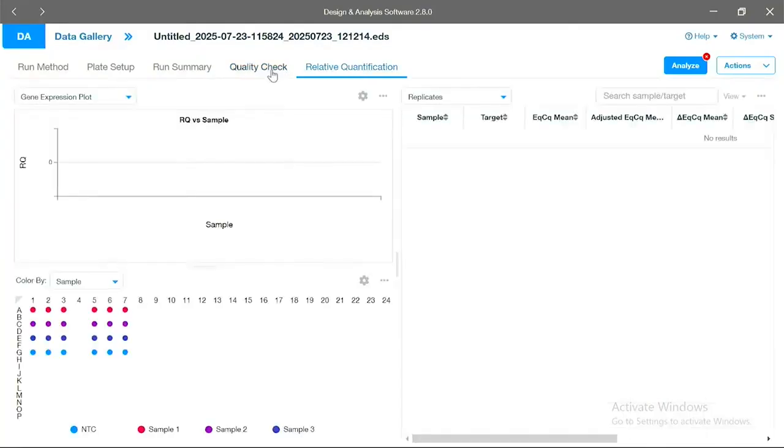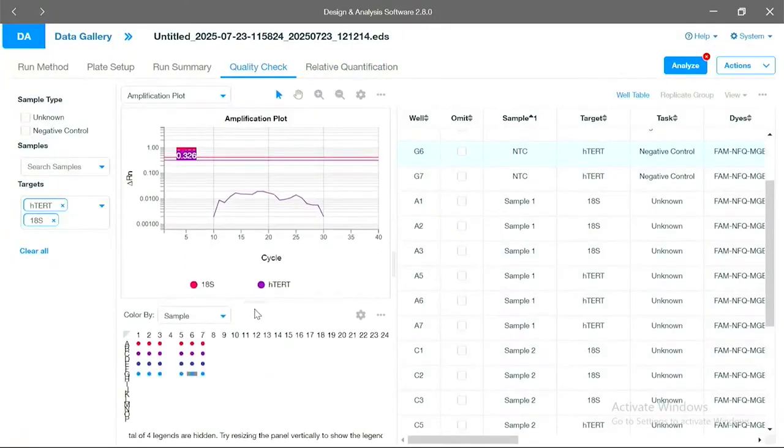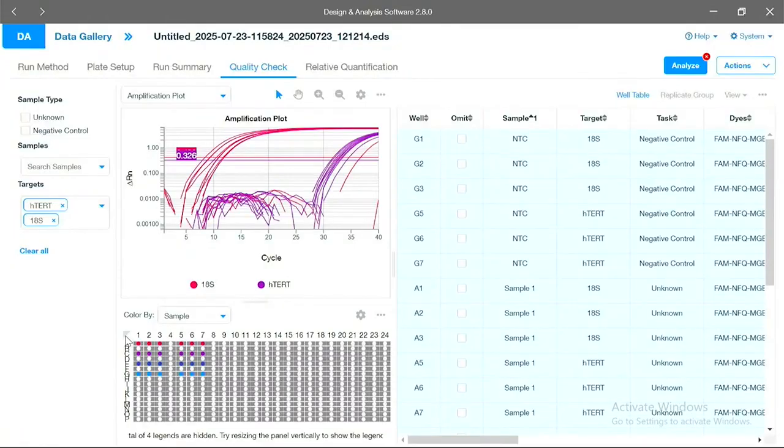All right. Before I move on, I wanted to point out that each of these assays, each of these tests, is going to be evaluated with a threshold value independently. They are separate tests. They are going to be assessed individually because they have different properties. They have different expression levels. They have different efficiencies. So it doesn't make sense to lump all of the data together, but more to treat it separately and individually.